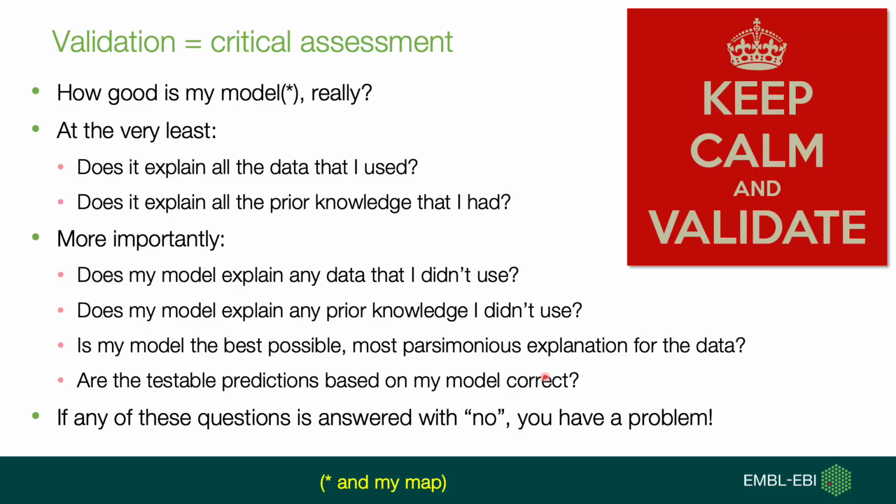So validation really is critical assessment of your model, and in case of Cryo-EM also your map. Just focusing on the model, your model should at least explain all the data that you used, and it should explain all the prior knowledge that you used, for example bond lengths and bond angles. But that just verifies whether your refinement program has done a decent job. In order to assess the accuracy and correctness of your model, it's much more important that it does some of these things.